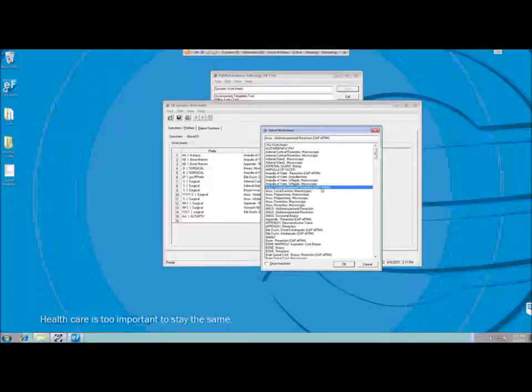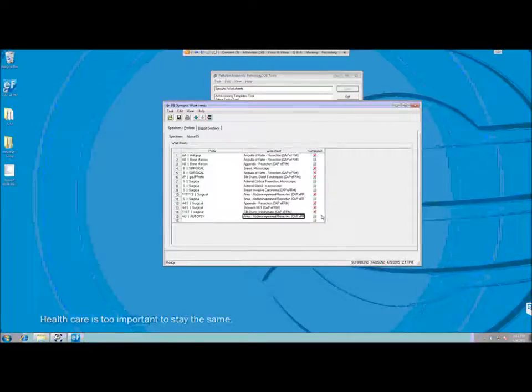So I'll just pick the mTuitive worksheet, and then the suggest flag. That basically works the same way. If I check that, it's going to create an empty instance of that worksheet when the case is accessioned. So I'll just save it, and now that specimen is associated with that mTuitive worksheet.